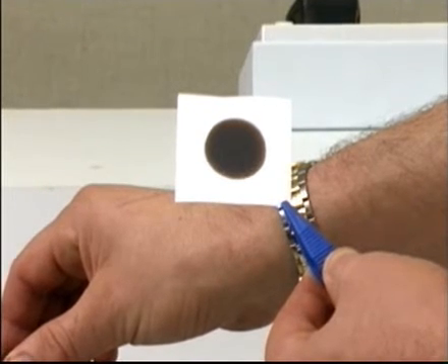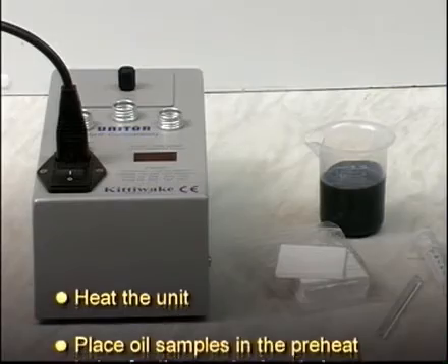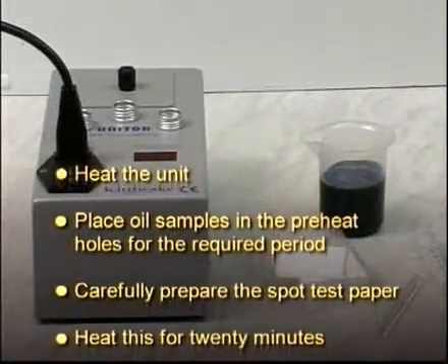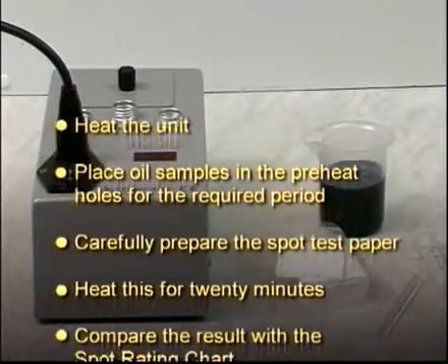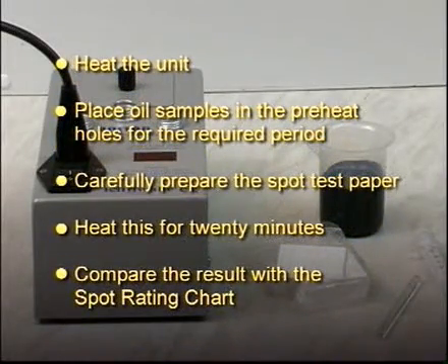To summarize: heat the unit, place oil samples in the preheat holes for the required period, carefully prepare the spot test paper, heat this for 20 minutes, then compare the result with the spot rating chart.